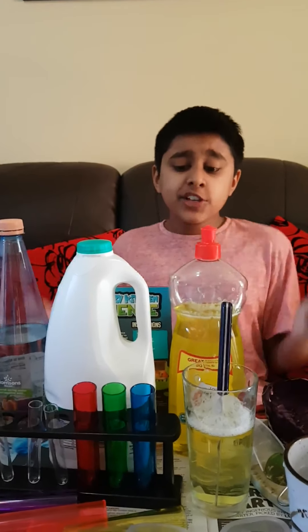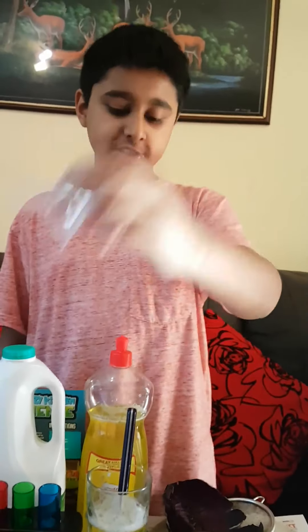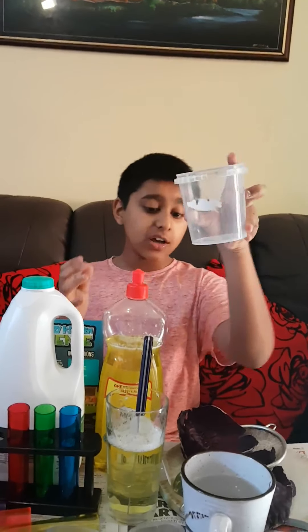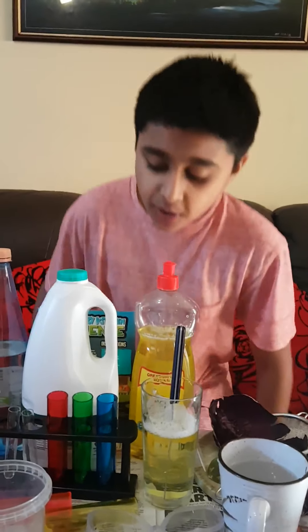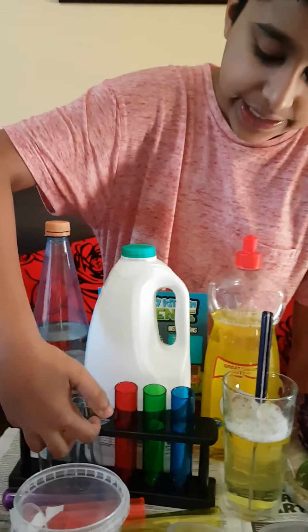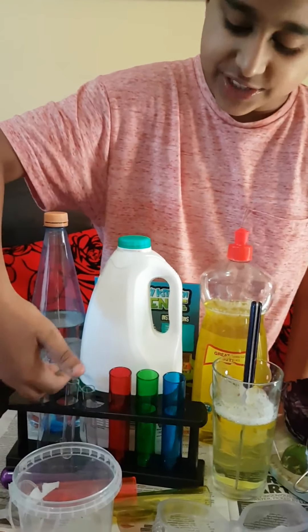To do this practical you will need a funnel — any size, but I've chosen this one. You will also need a beaker, but if you don't have one, a small transparent plastic container or glass is fine. And you will also need test tubes.